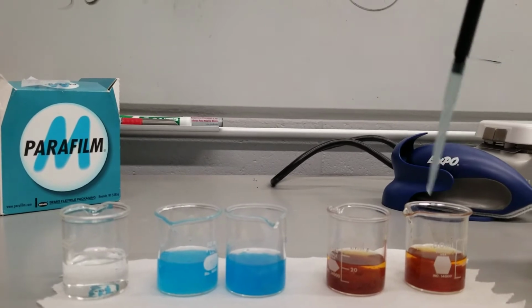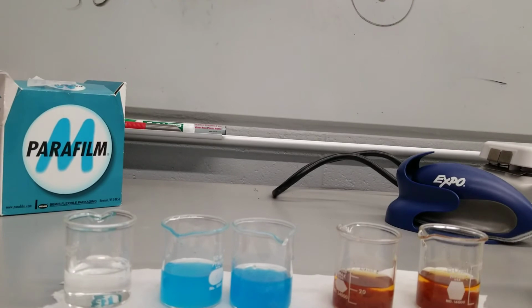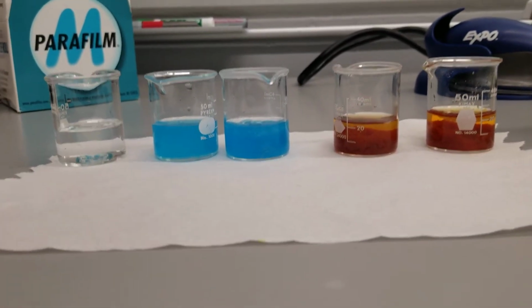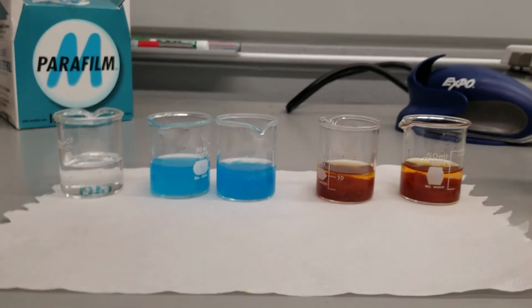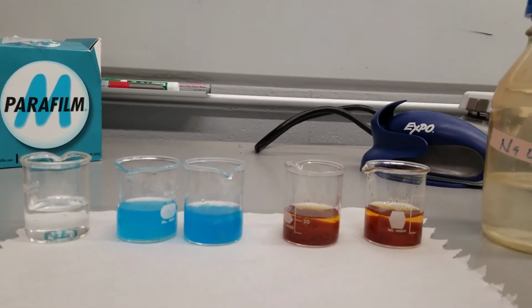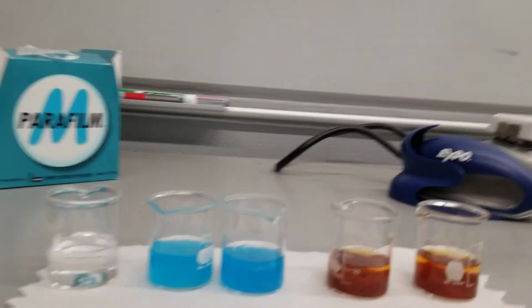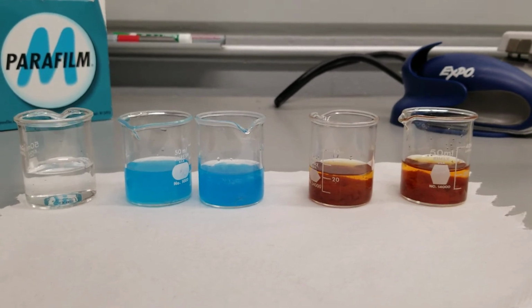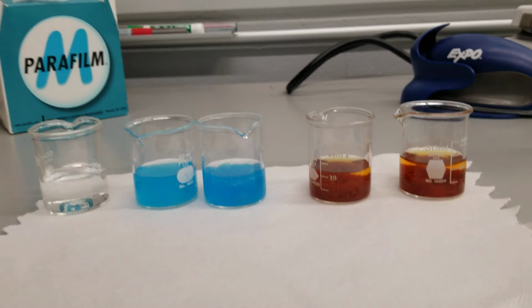You have to pay attention to the fact that I am using exactly the same amount of sodium hydroxide for all of them. So in that case, the depth of the color is directly proportional to the amount of heavy metal present in that water sample. As you leave this to sit for a little while, you will see that the depth of the color does increase for each of the samples except for the control, which does not have any heavy metal, or high amount of heavy metal, at least that we know of, present in it.